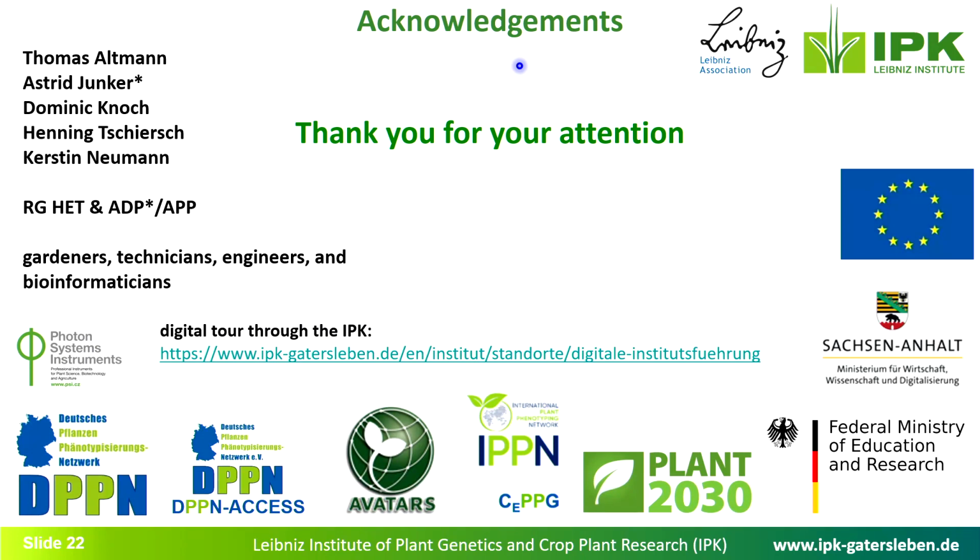All right, thank you very much, Marc. And there's already the first question by Hendrik. Yeah, Marc, this is very nice. Temperature is incredibly important, but yes, light is important as well. And you haven't talked about light at all. You said you could achieve 1500 micromole at 10 degrees or so, right? But what was the daily light integral that you applied during this course of the season?